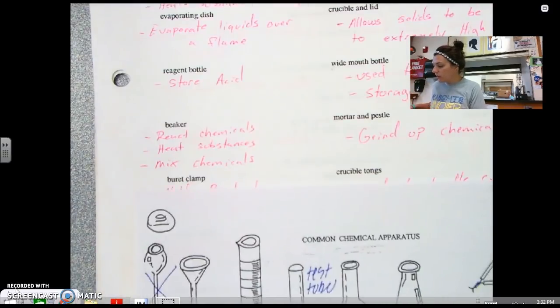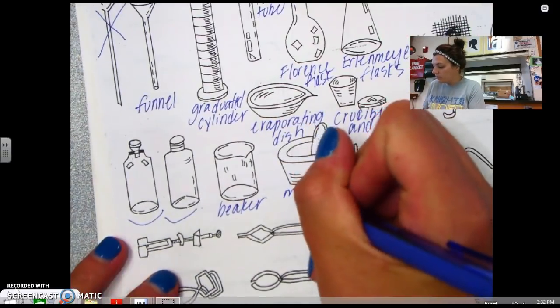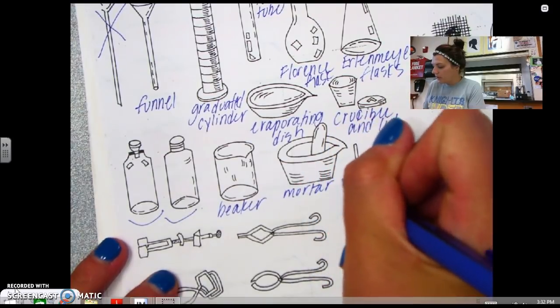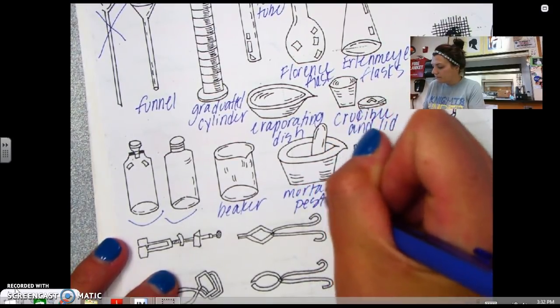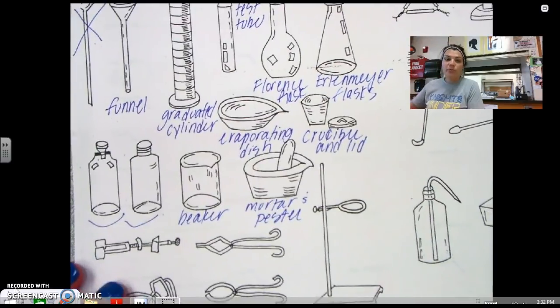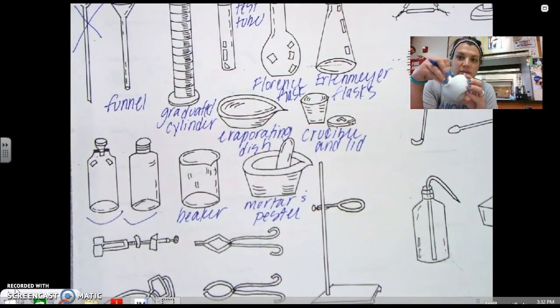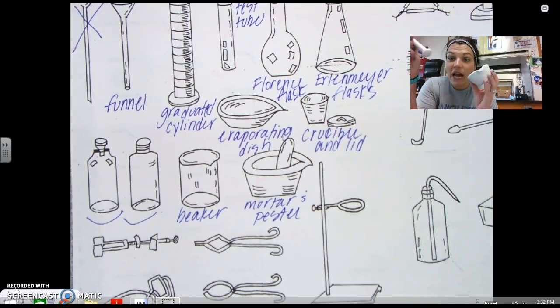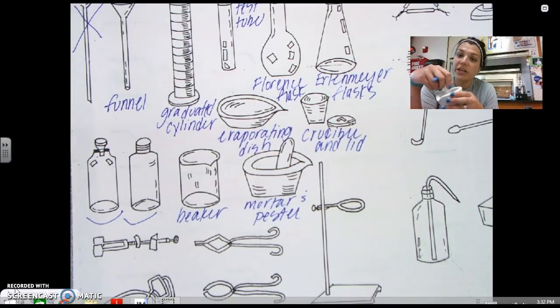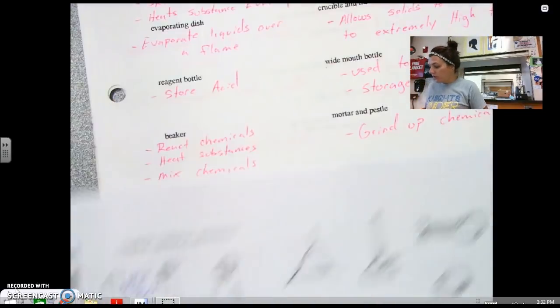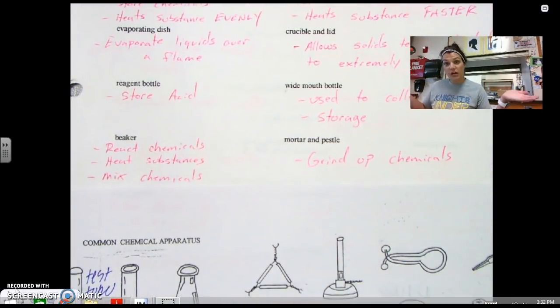The next one is a mortar and pestle. So this is a mortar and pestle. And you probably have seen these before, especially if you watch certain shows or certain movies. This is what we use if we have a solid and we need it in smaller pieces. We can put it here and crush down our solids so we can dissolve it into water. So a mortar and pestle obviously grinds up chemicals.